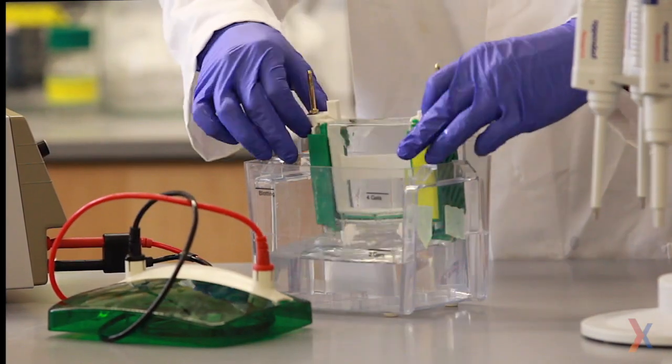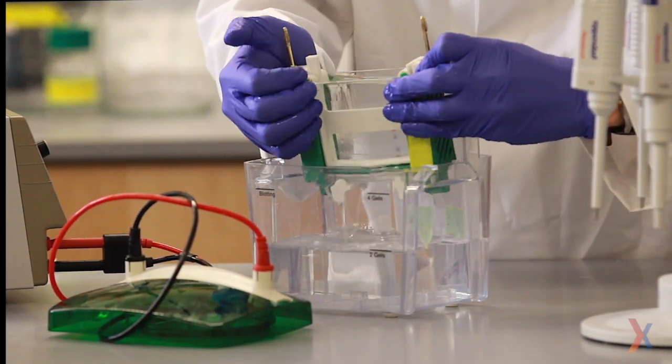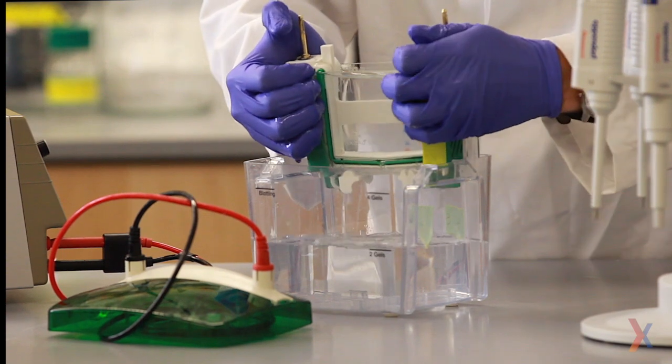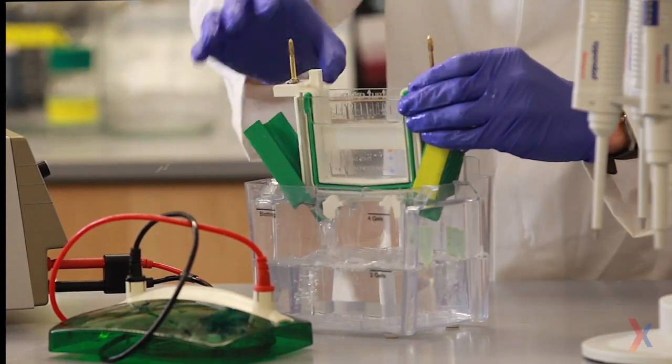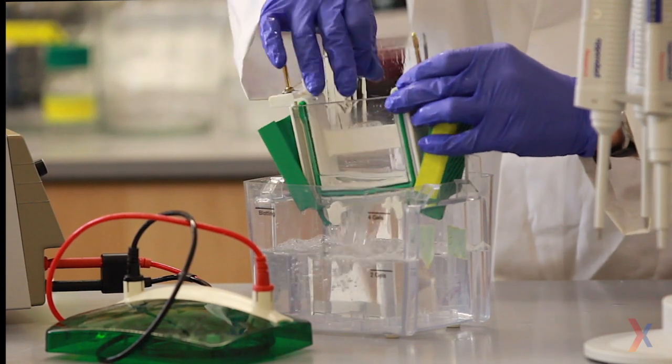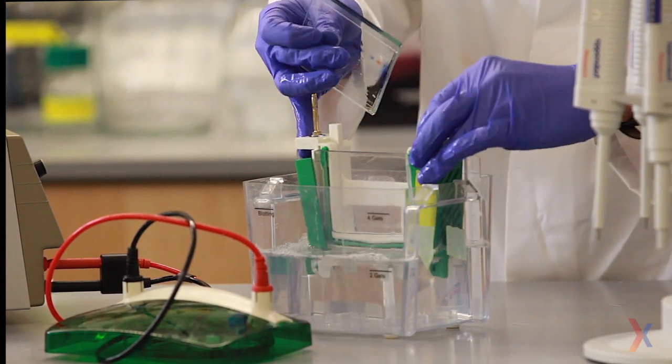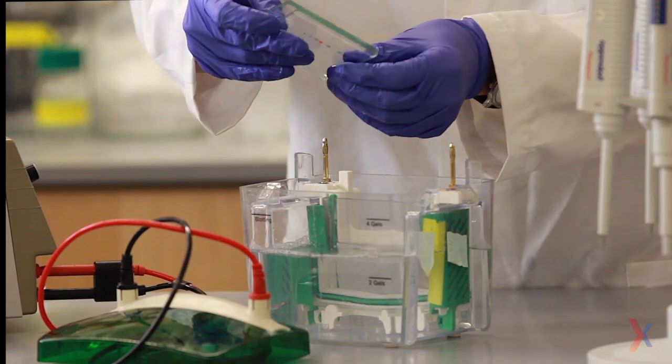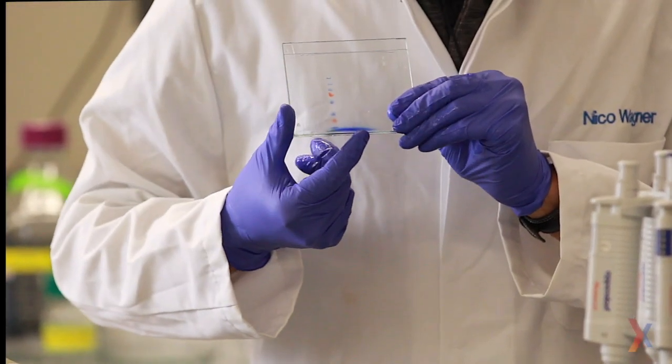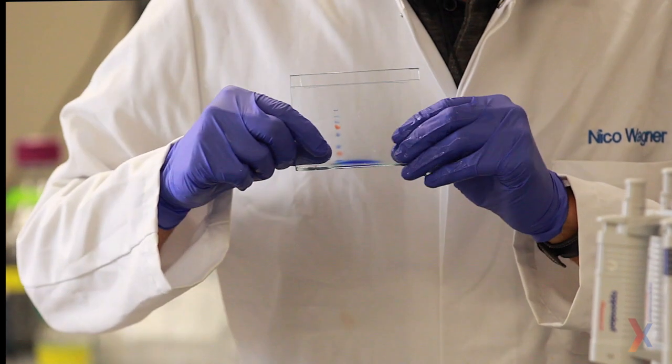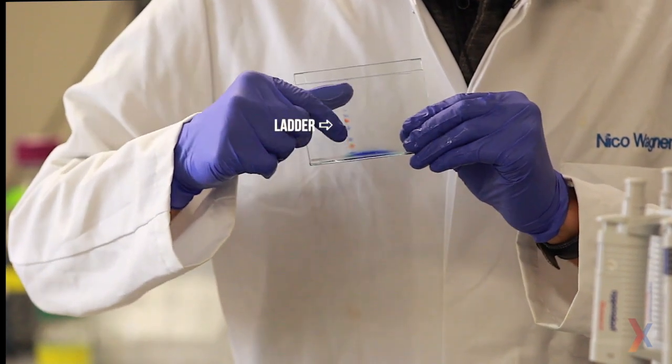Disassemble the gel box and remove the gel from the cassette. I'm being careful to contain all of the buffer within the gel running box so it doesn't get on the bench. And now that it's out we can take a look at it. Like I already mentioned, the loading dye has made its way to the bottom and the ladder bands have nicely separated in lane one.